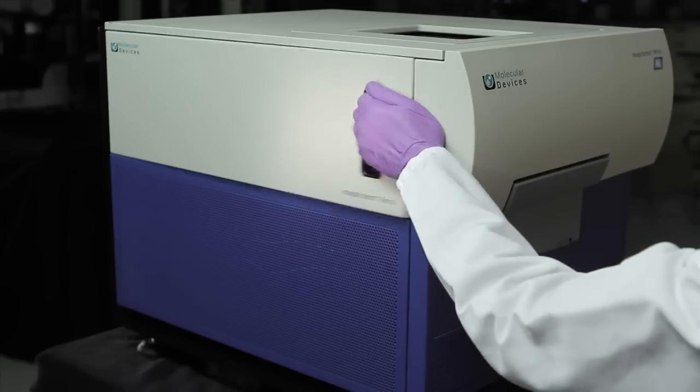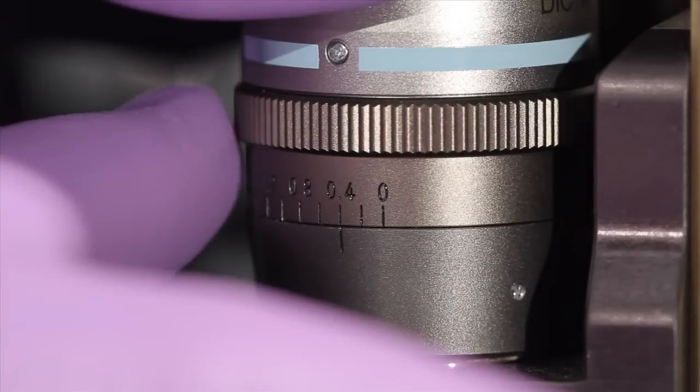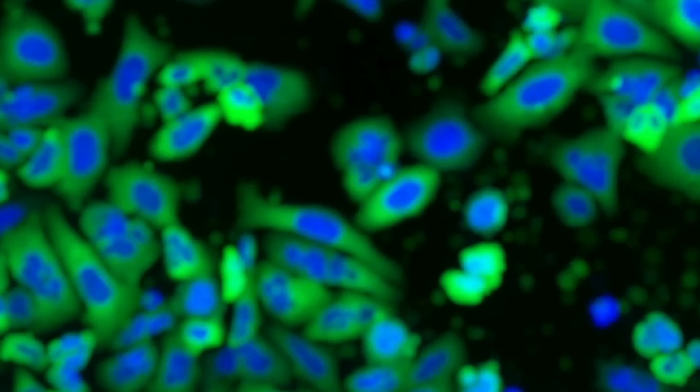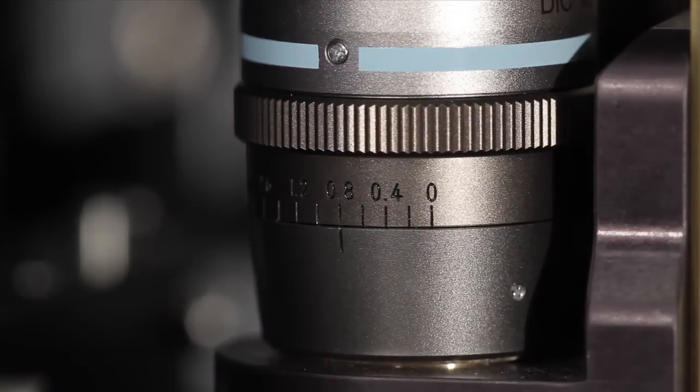If the objective is in the outermost position, it can be adjusted by removing the side panel. The correction collar should be set to the physical thickness of the plate bottom or cover slip. Adjusting the correction collar properly is important for optimal image quality.